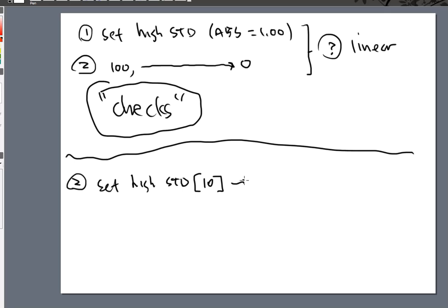And what will happen is that this will make the machine run a 1 absorbance at a 10 part per million. And here's why. That's a really wide window that we did first. So we're going to chop it down, and we're only going to focus on the lower concentrations here, 10 and lower.